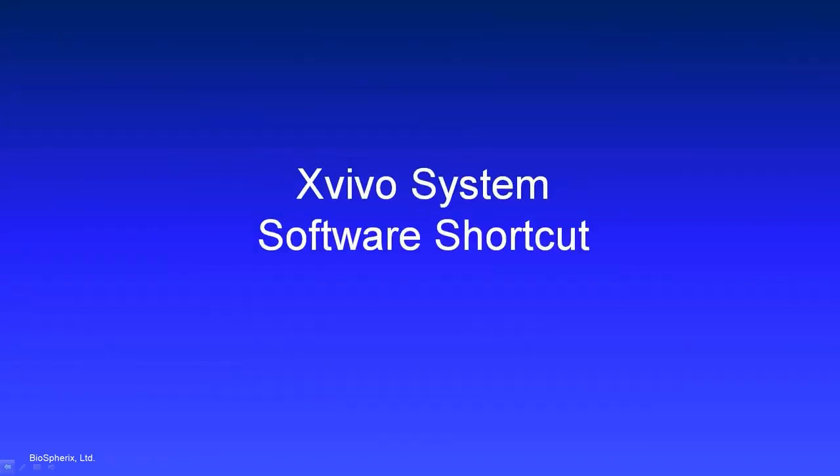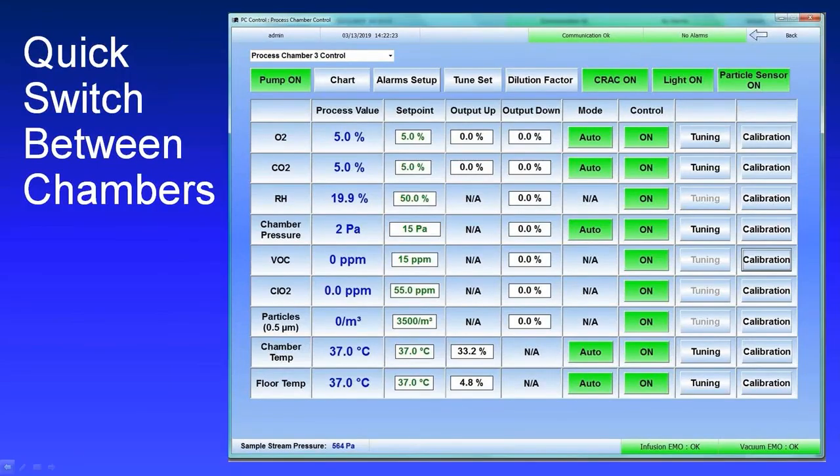So there's a quick shortcut in the Xvivo System software I wanted to show you as well. Up in the left-hand corner of the system software that you see when you're looking at the sensor information for any particular chamber, you'll see this little drop-down menu. It says Process Chamber 3 Control in this particular one. If you click on the little arrow in that drop-down, you will see Process Chamber 2, Process Chamber 1 show up. So you can very quickly switch between chambers of the same type with this little drop-down menu.